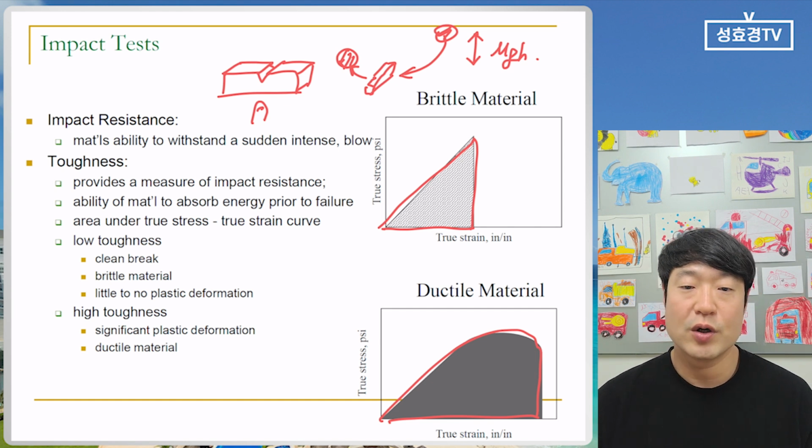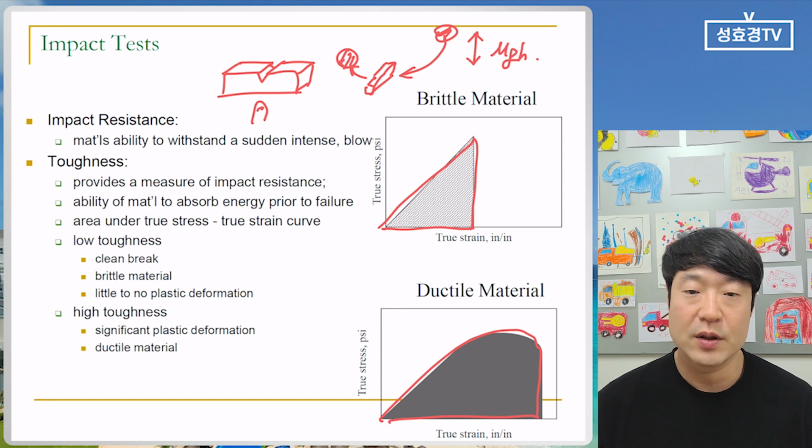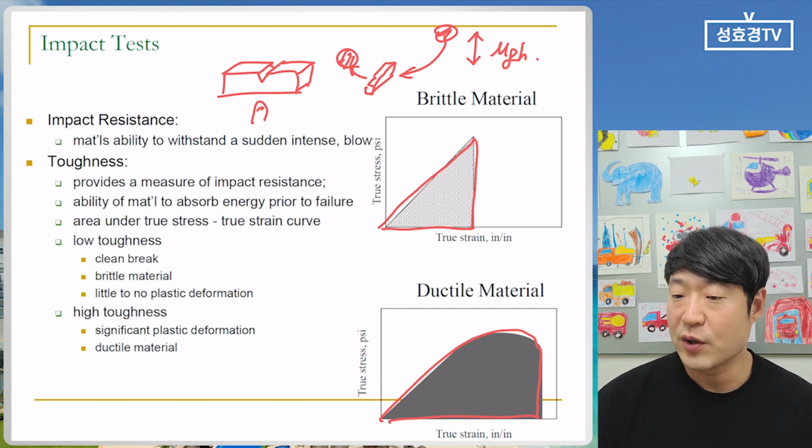But when we want very high accuracy of the toughness, that is the fracture toughness. The body is categorized into three groups. One is the smooth body. Another is the notched body, like the Charpy impact properties, and the other is the cracked body, for the fracture toughness. But this is a very good way to understand the toughness briefly.